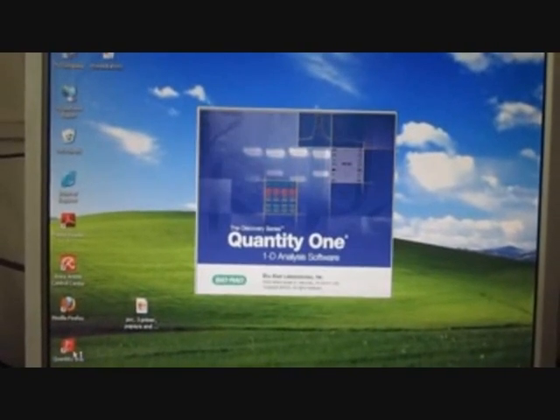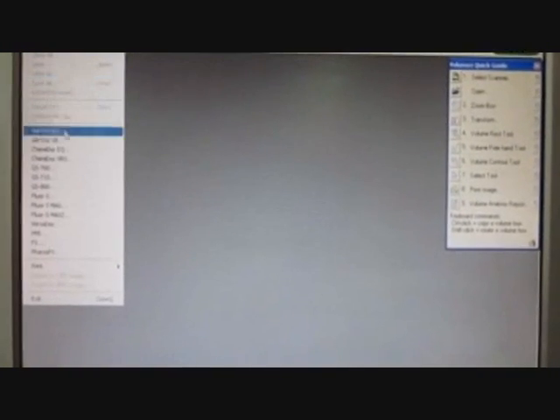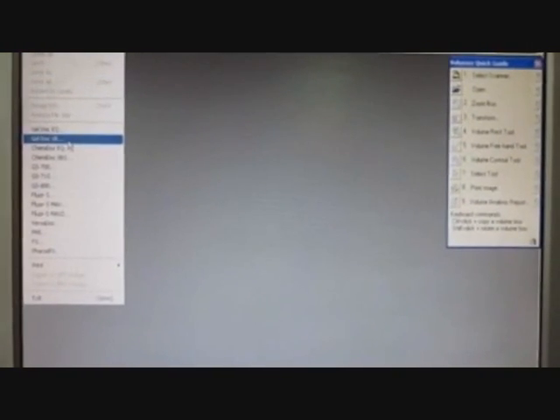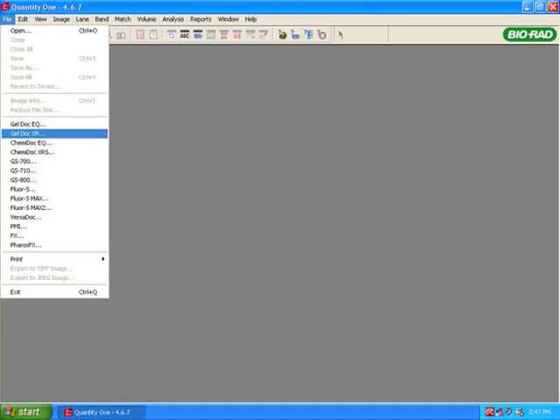Open the Quantity One application saved in the system. Select Gel Doc XR from the file menu. This provides a simple luminescent image of the gel.